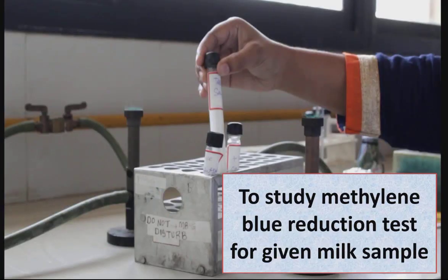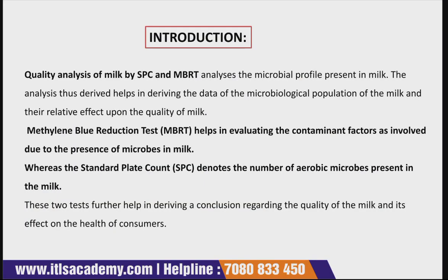So today in this lecture we are going to study a new experiment, that is to study the methylene blue reduction test for a given milk sample. The introduction of the topic says that quality analysis of milk by SPC and MBRT analyzes the microbial profile present in milk.